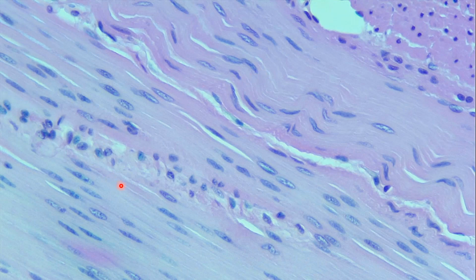And smooth muscle, it's kind of like you wiped away all the striations. You're not going to see any of those stripes or striations. All you're going to see are fat nuclei and some pink. Now, a lot of times students will mix up smooth muscle with dense regular connective tissue. So feel free to pull up the connective tissue video after this and try to compare the two and make sure that you pinpoint what some of those differences are.